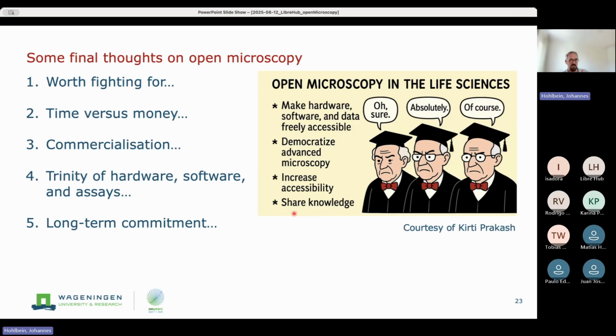How was the data analyzed? In some labs there's still very little attention to that, so you get flashy, shiny papers where people have no idea what happened in the background, severely limiting reproducibility. So for you as a PI, for you as a student, if you care about that, you can make the change happen.